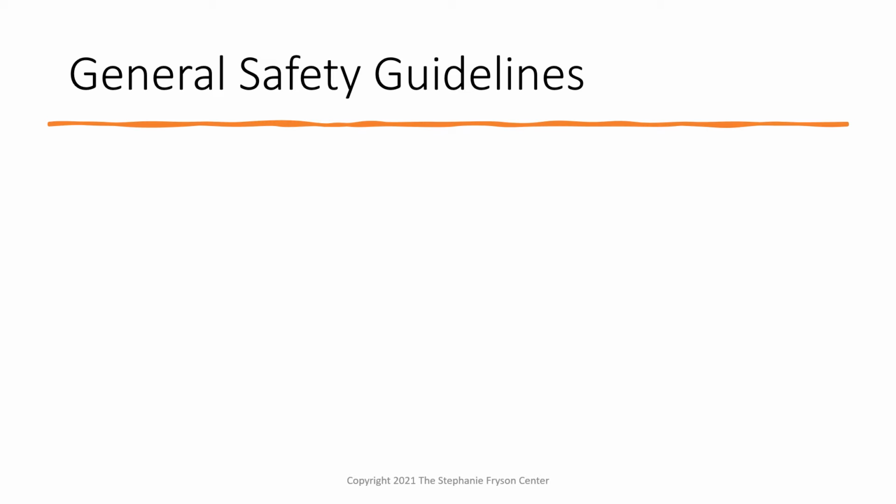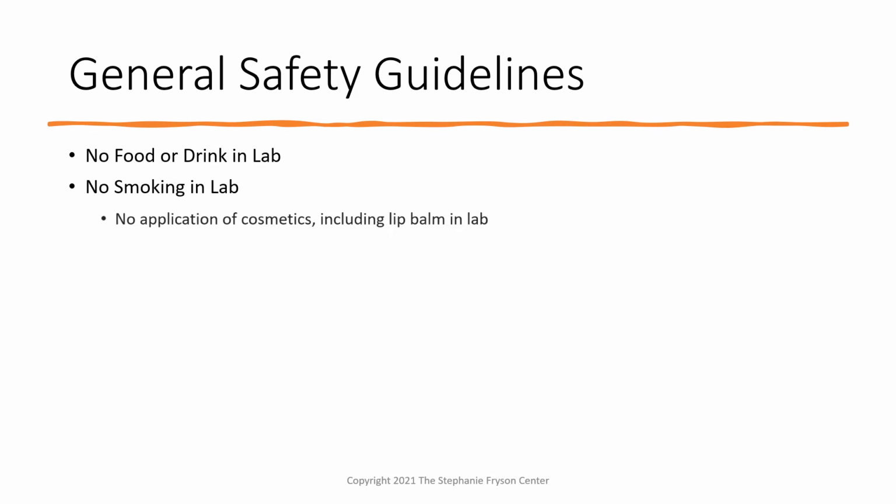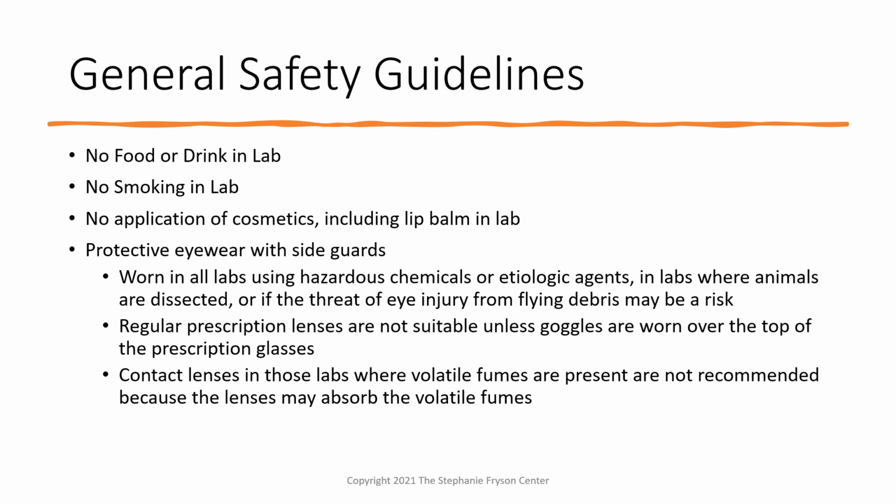Let's get into the general safety guidelines, and again, it applies to all the courses. Don't eat or drink in the lab. Don't smoke in the lab. Don't apply cosmetics in the lab. Wear your protective eyewear with side guards.